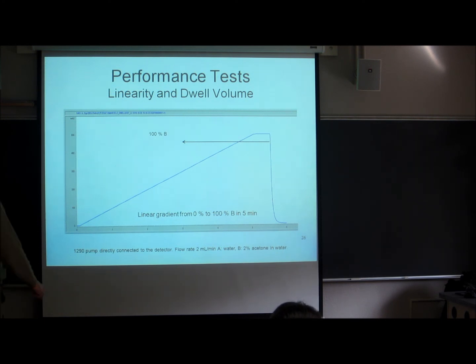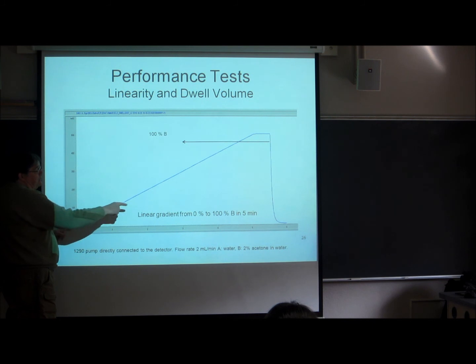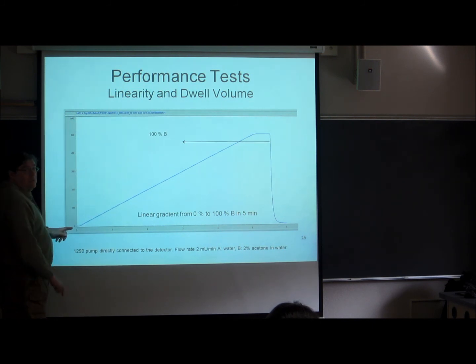So what we do is we start out the experiment, and we tell it to start pumping B into our solvent A. And there's a little delay here. What's this delay from?